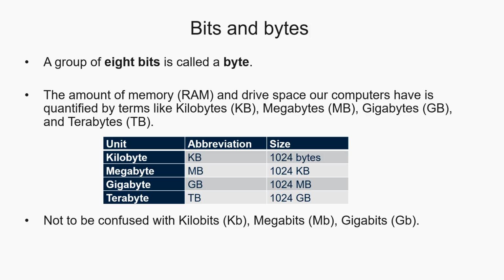It's important to distinguish between bytes, indicated with a capital B, and bits, indicated with a lowercase b. Image files can become very large because every pixel requires storage space, and modern microscopy datasets may contain millions or even billions of pixels. As image dimensions, bit depth, and number of channels increase, file sizes grow rapidly.